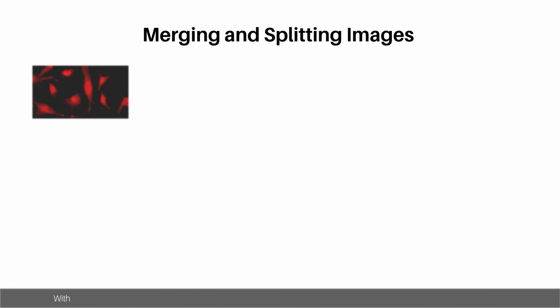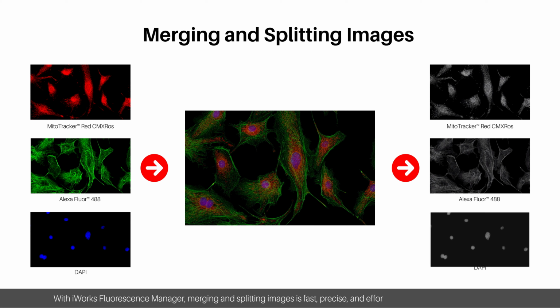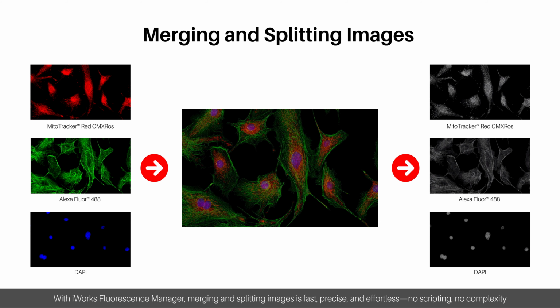With iWorks Fluorescence Manager, merging and splitting images is fast, precise, and effortless. No scripting, no complexity.